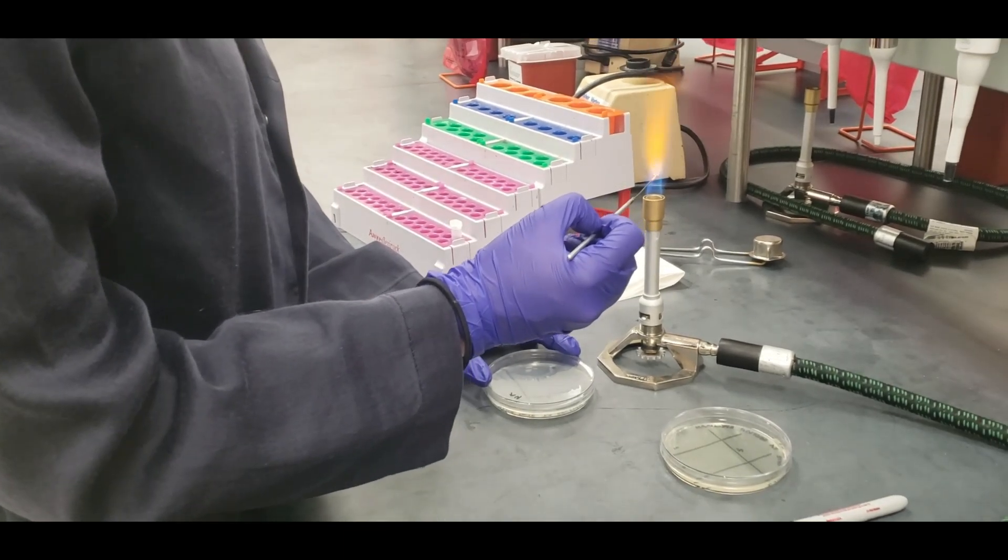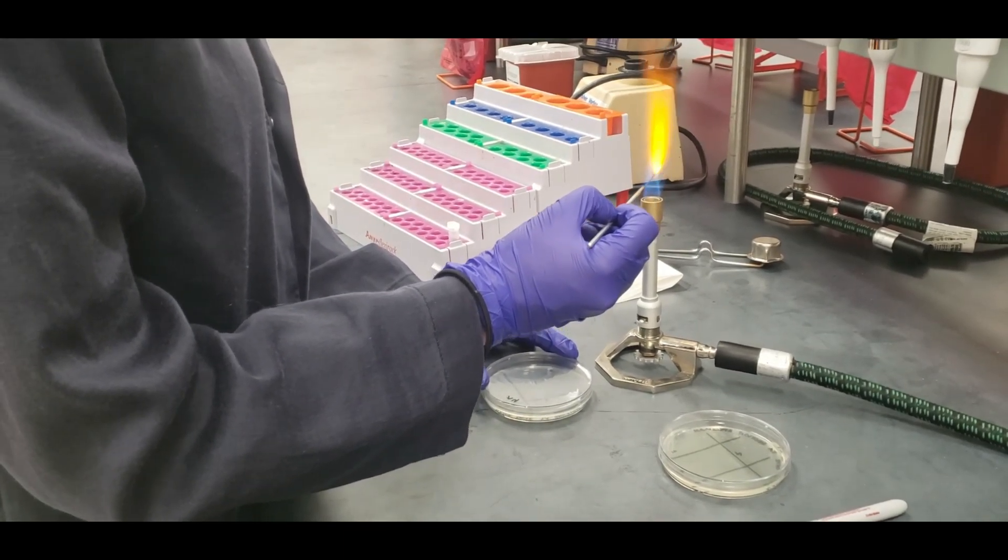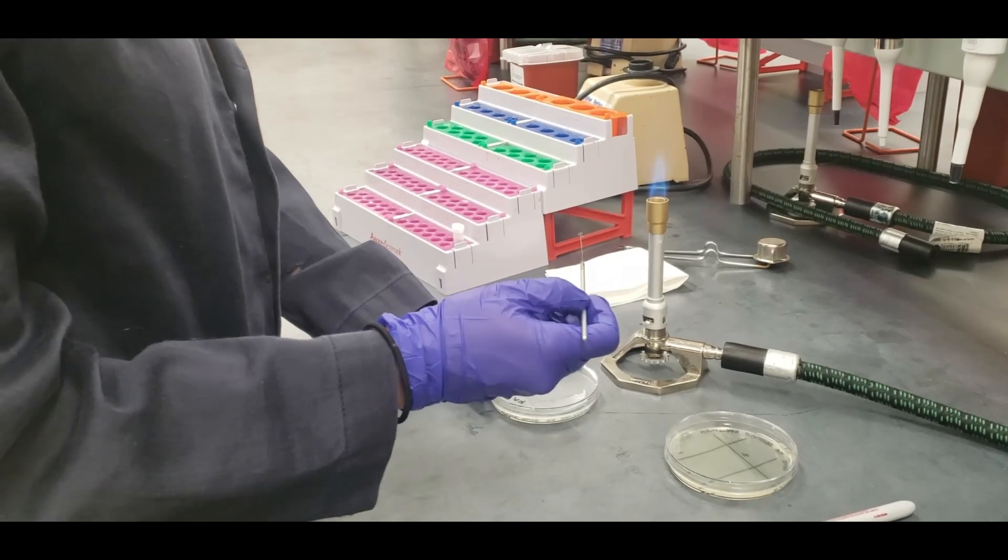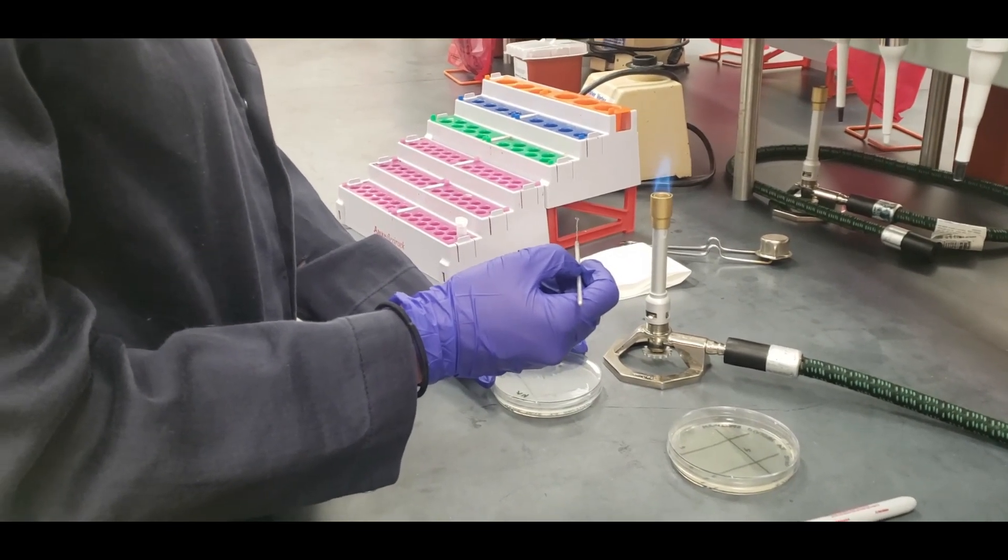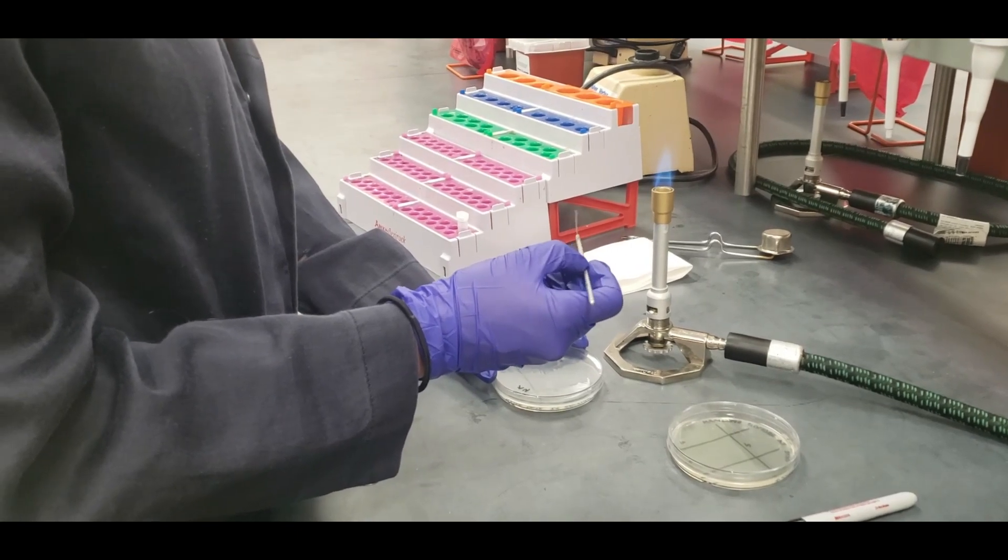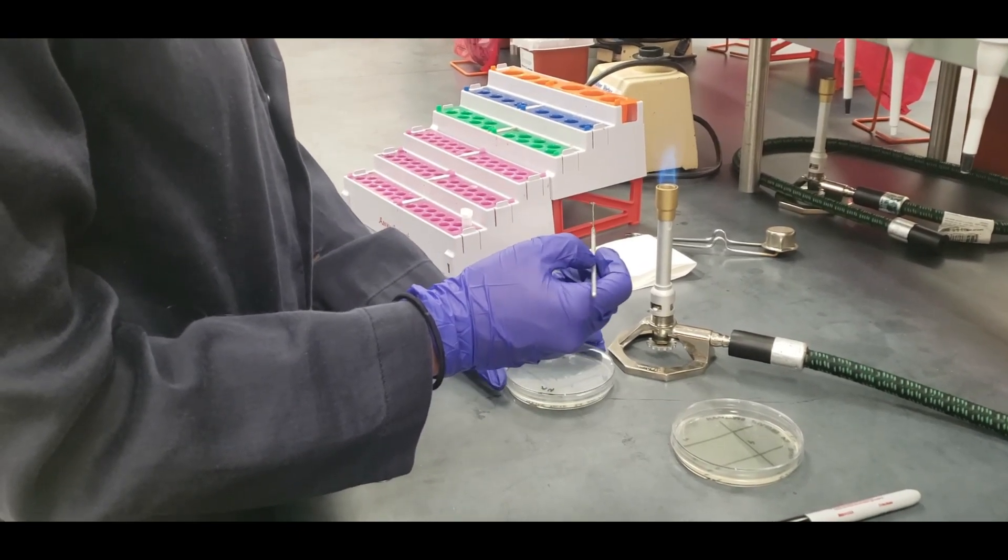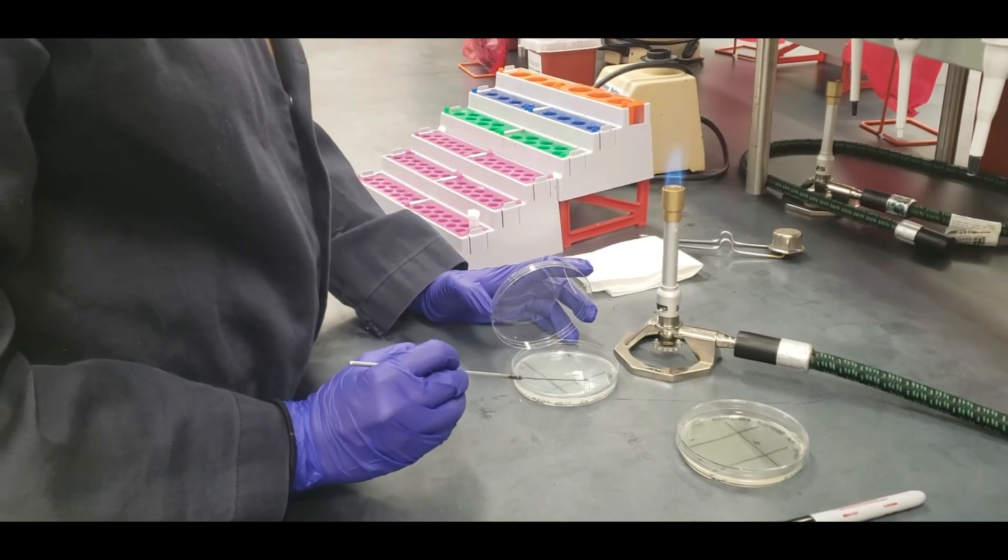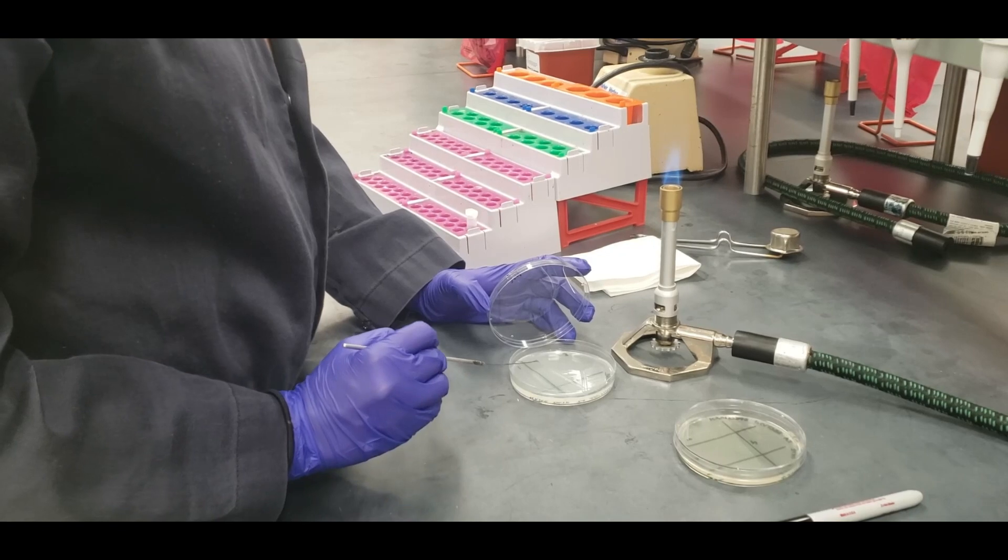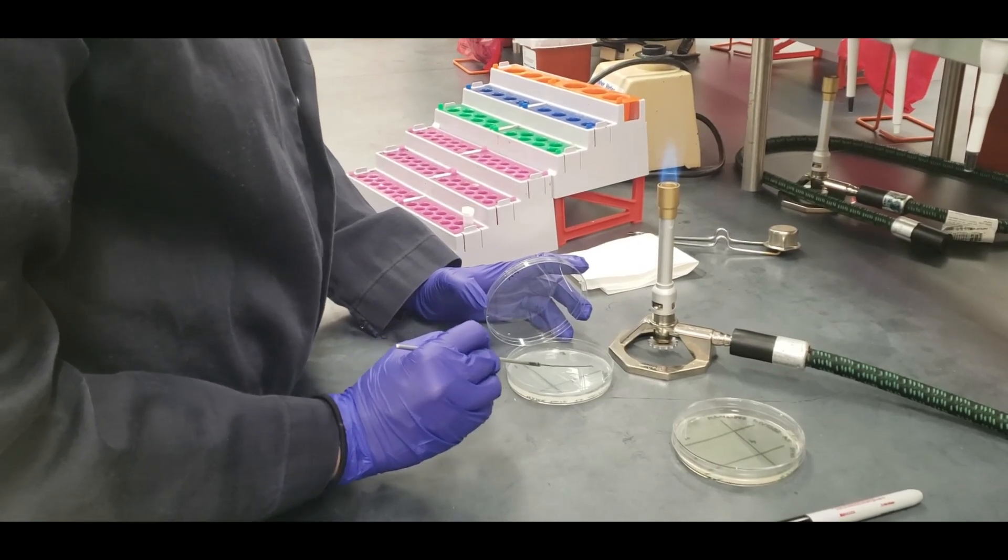Sterilize your loop again, letting it cool down completely. Then, you're going to pull one time from the second section into the third section, and then flame your loop.